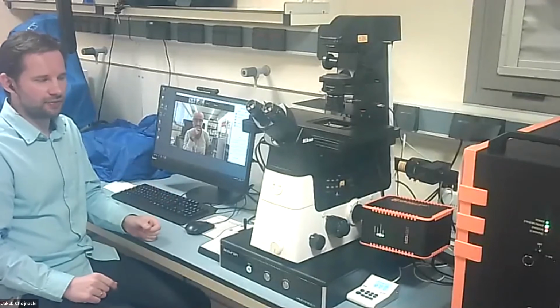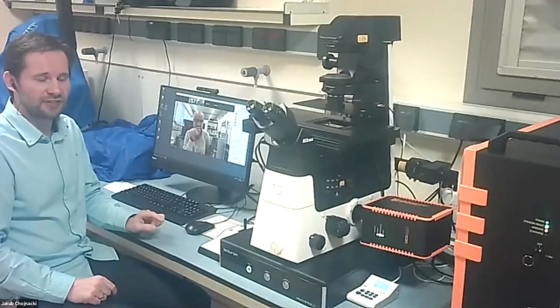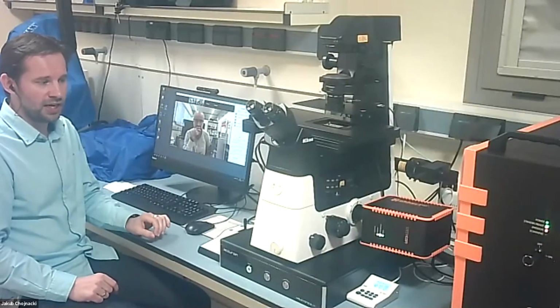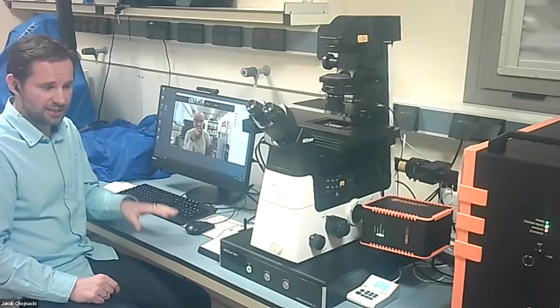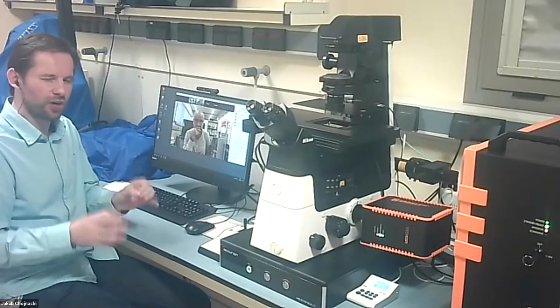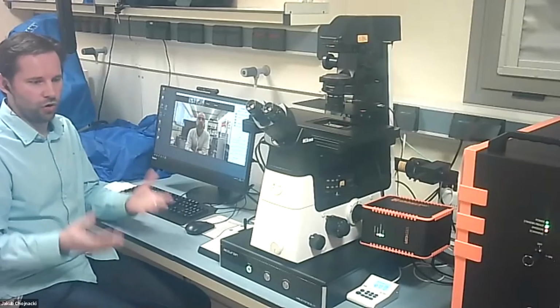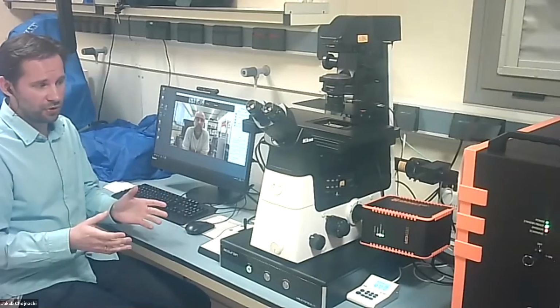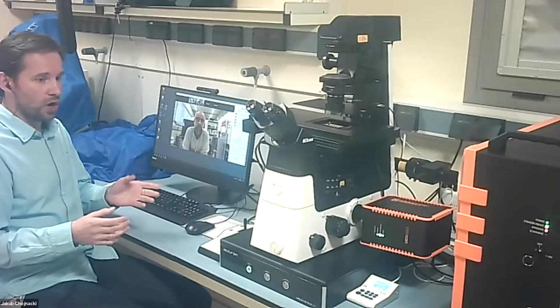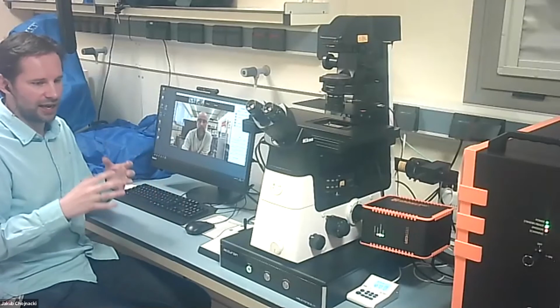And in terms of the next several years, I think those techniques will gain huge prominence, specifically because they're live-cell compatible. Advanced fluorescence microscopy, if you can combine these advances in resolution with live-cell microscopy, is going to be incredibly important to study virus-cell interactions or cancer or anything else, but very importantly, utilizing the advantage of live-cell microscopy. So we can study things as they are, not when we fix them, when we chemically treat them.